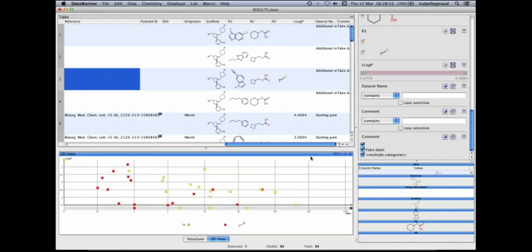It does mean that you can't access external programs then, I presume? No. For the moment, it does not access external programs, and you cannot script them externally. I'm not sure if it is planned to have this possibility. I have to ask the developer, who is Thomas Sander. You can ask him.